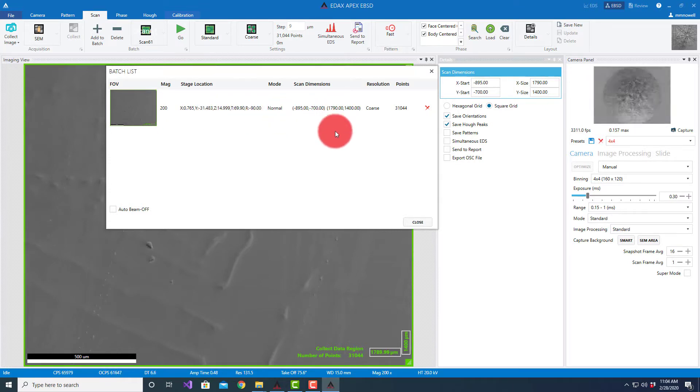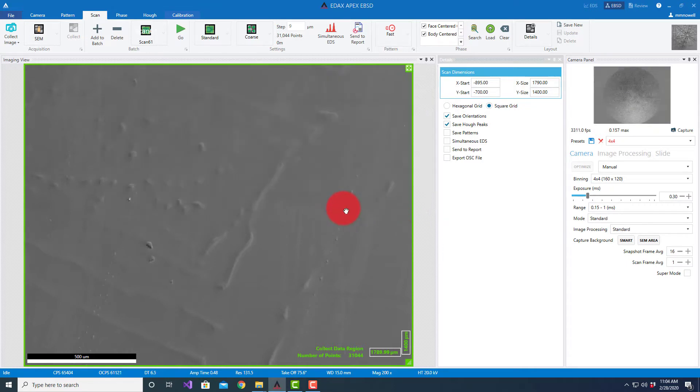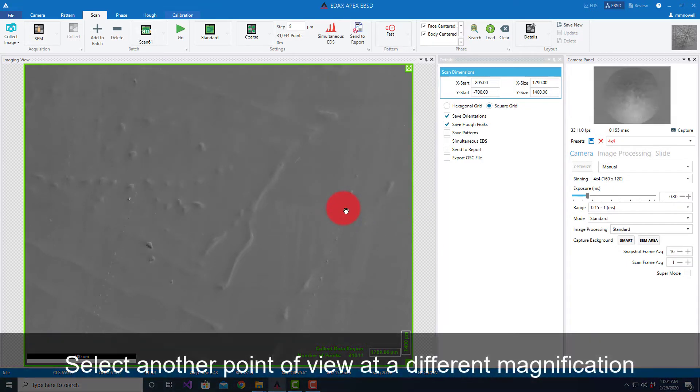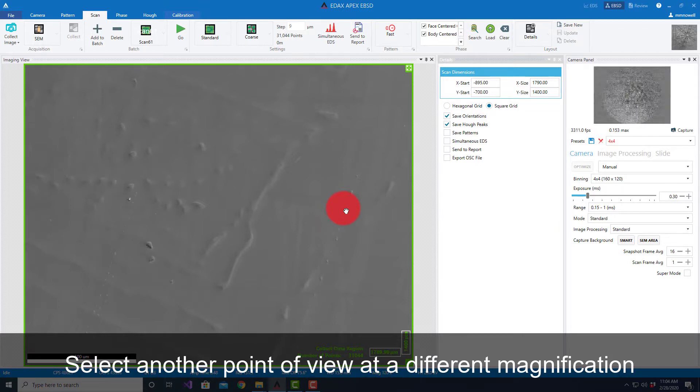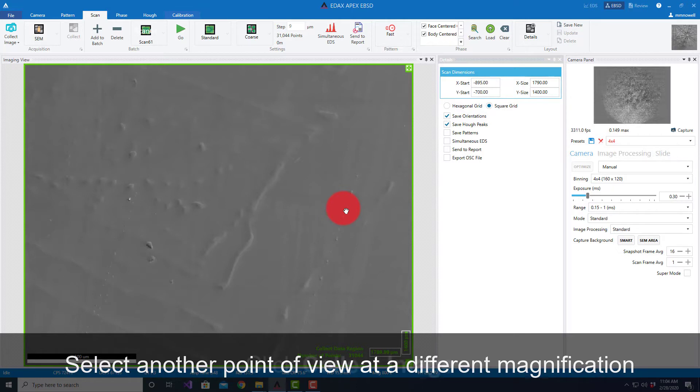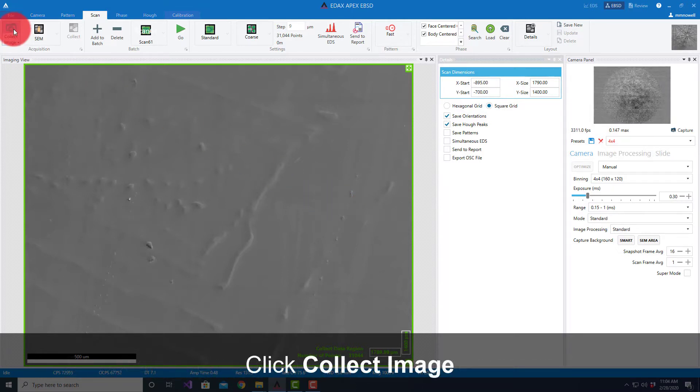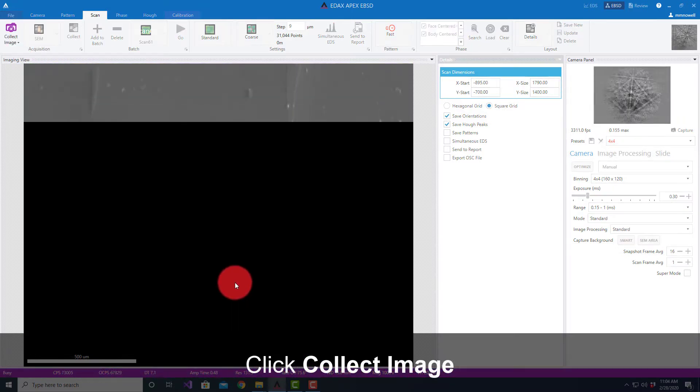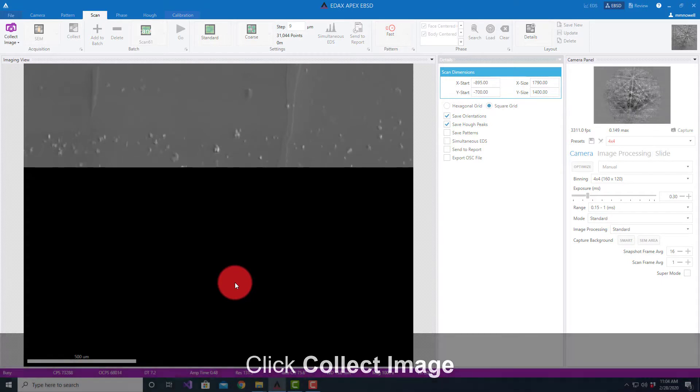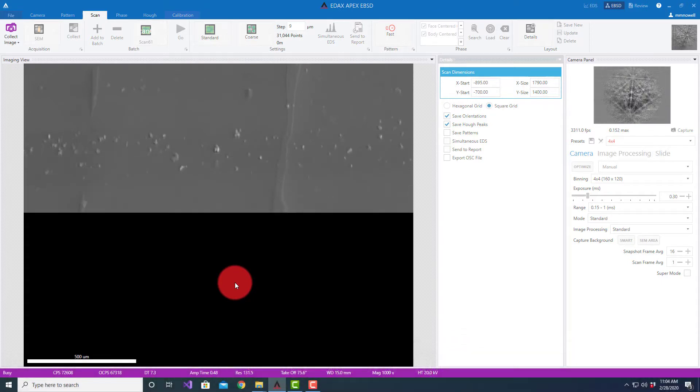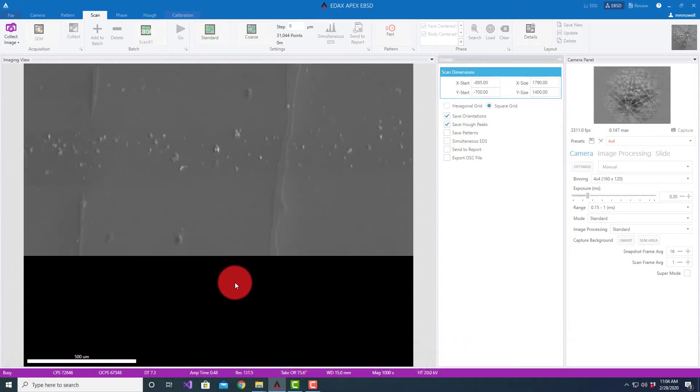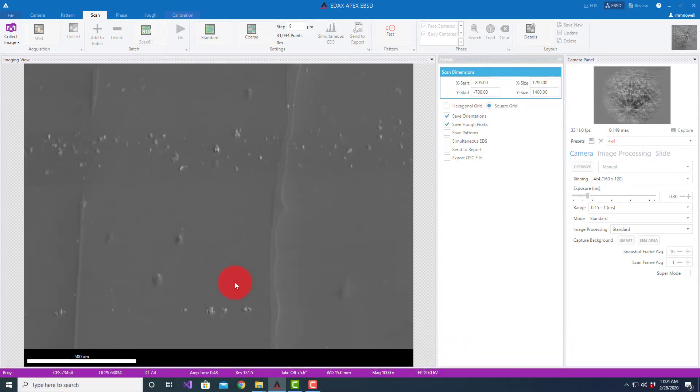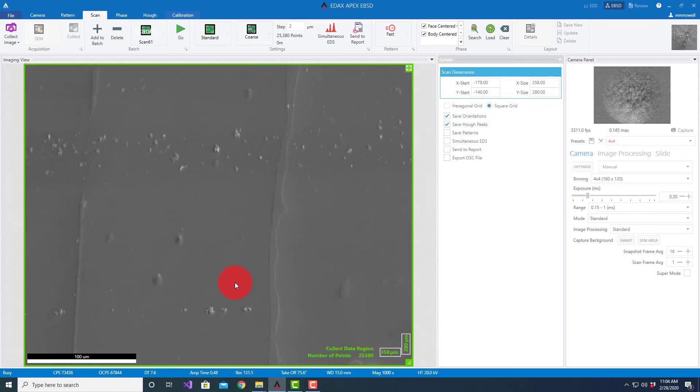So then I'm going to go to another field of view. I'm going to go to a slightly different position and a different magnification. I'll collect the image here.